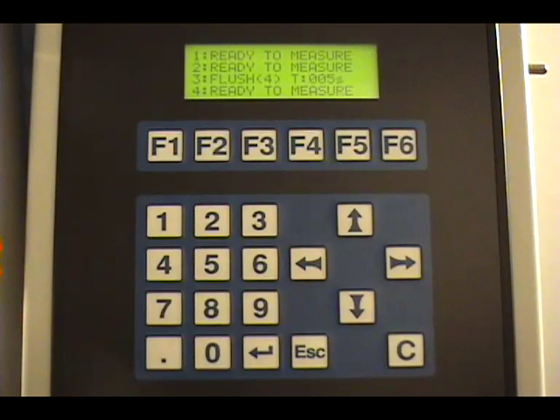As always, the LCD screen shows detailed information indicating how many flush cycles remain and how much time there is before the following injection.